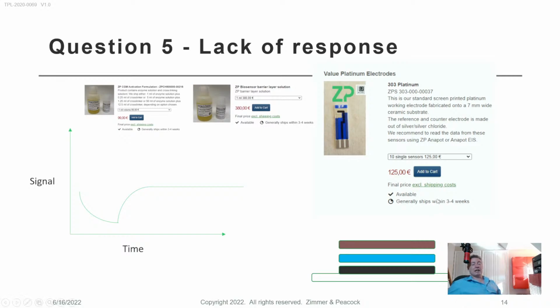So it's the platinum. The carbon electrodes need to be changed for platinum, which I had a suspicion about. But first of all, I got them to play with the formulation. Changing the formulations didn't work. Then they sent me some more information, and we found out it's carbon. I think carbon is essentially the smoking gun in this mystery.